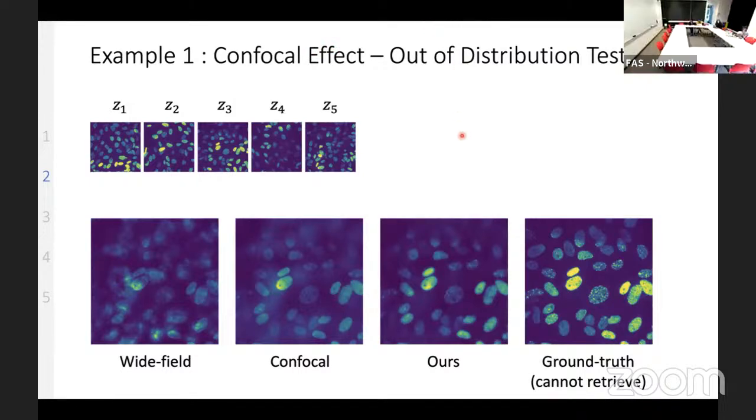The other thing is about the efficiency. There is another group of confocal setups where you can make the pinhole in a certain way, but then a very small amount of light passes through, even from the in-focus plane, and the contrast becomes better and better with that. So do you know what the efficiency is between this confocal and your confocal?